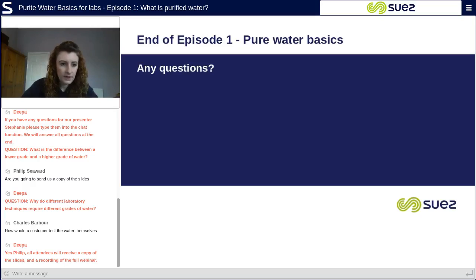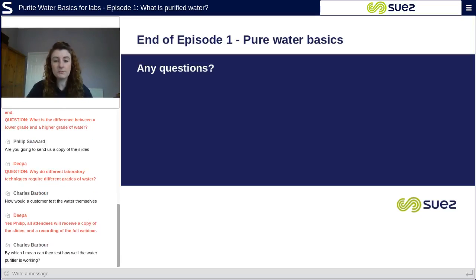Any more questions? How would a customer test the water themselves? For testing your feed water, to figure out how hard or soft your water is, you normally submit a sample for feed water analysis, which we can normally help you with, or you can look online at which water company provides the water in your area, and they usually have data on their website for water hardness and their feed water analysis.